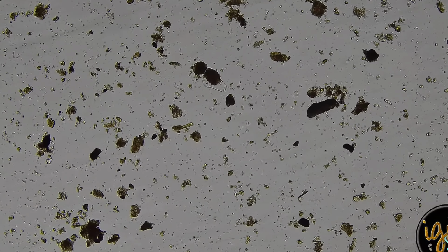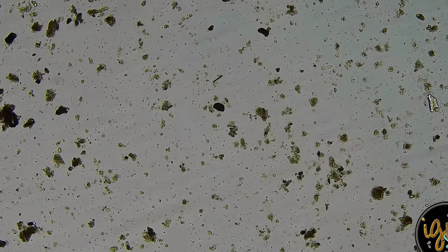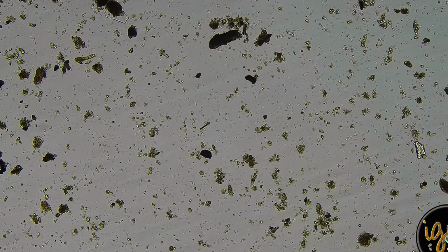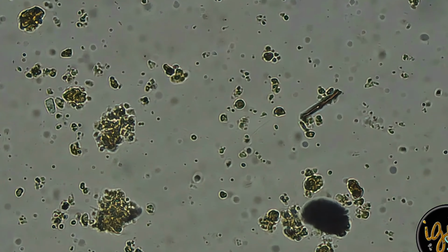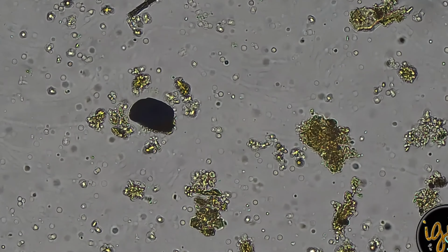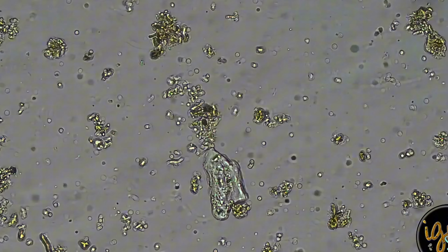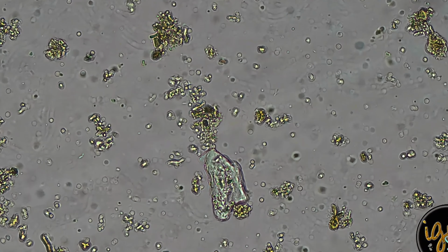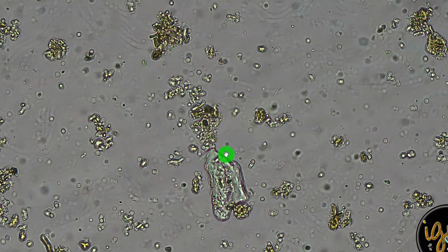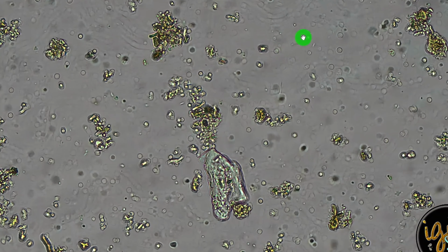Again, very good aggregation. Looks like you have charcoal in your soil, and I say that because it's dense black. Let me get close to it. Well, yeah, that's just deep carbon. Just cruise around here, and when I say aggregation, these clusters here are clusters that the bacteria create.